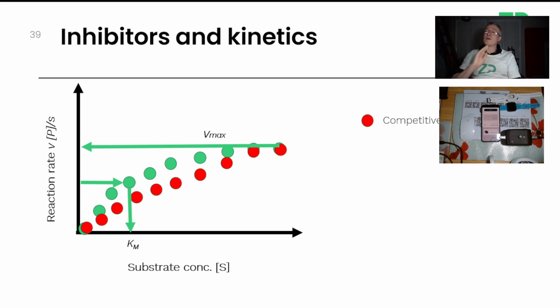you will find that your kinetics are slightly, let's say, decreased. And it's something that's just occurred to me, actually, that sometimes when we're formulating enzyme reactions, we can end up accidentally creating competitive inhibitions. I'm just thinking about data that we've gathered over the years. And I realize that sometimes it's actually useful to us, because in this particular case, we're increasing the linearity. The Vmax stays the same, but the linearity is essentially improved, because you can see that through the Km increase.